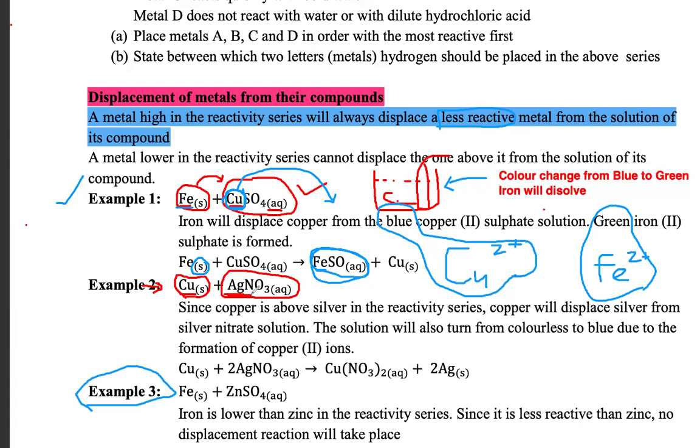The copper will dissolve, and then the silver will remain on its own in solid form. The silver now will form as deposits inside the solution, to actually be in solid form, right? Yes. Exactly.